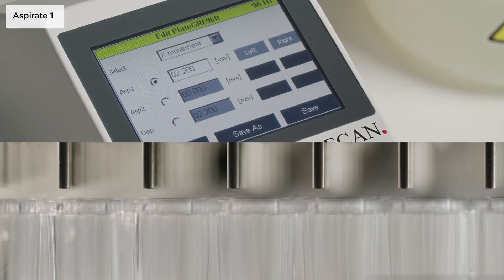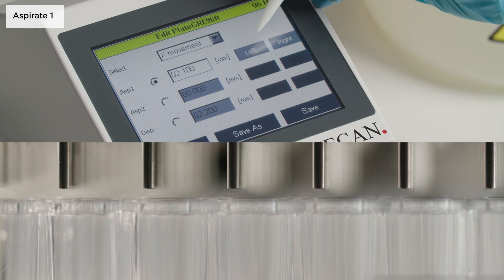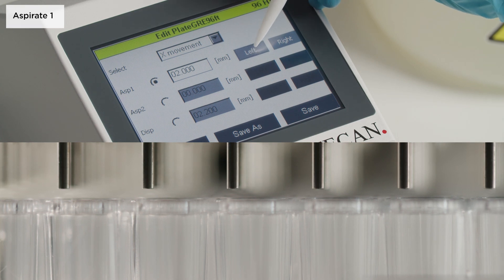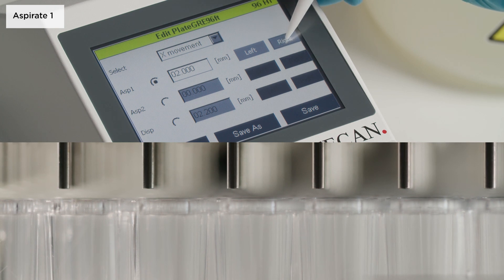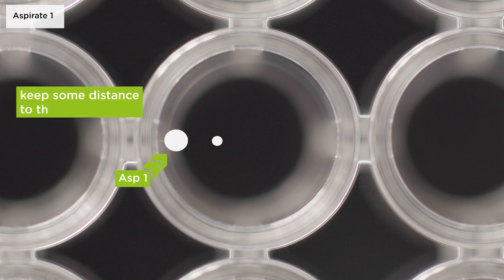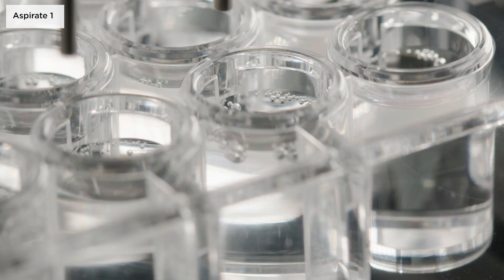The first aspiration position is available for all plate types. Use the left and right buttons on the instrument to change the needle position and visually inspect the movement in real time. For flat bottom plates, the needles are typically positioned on the left side of the wells. Make sure to keep some distance from the well border to prevent drops remaining in the well or the needles hitting the plate.